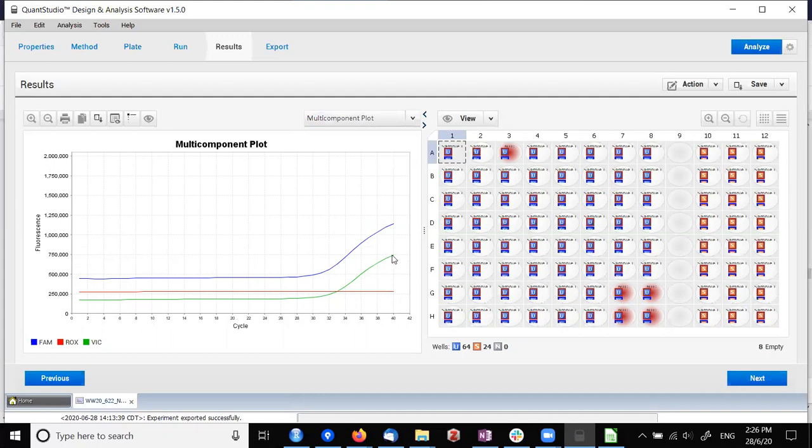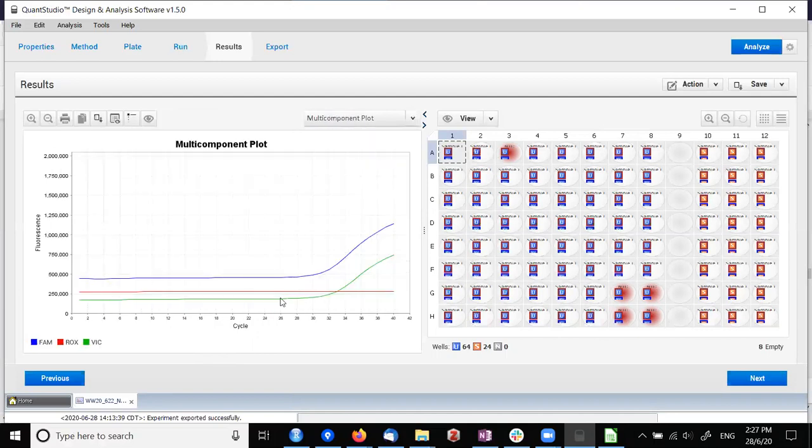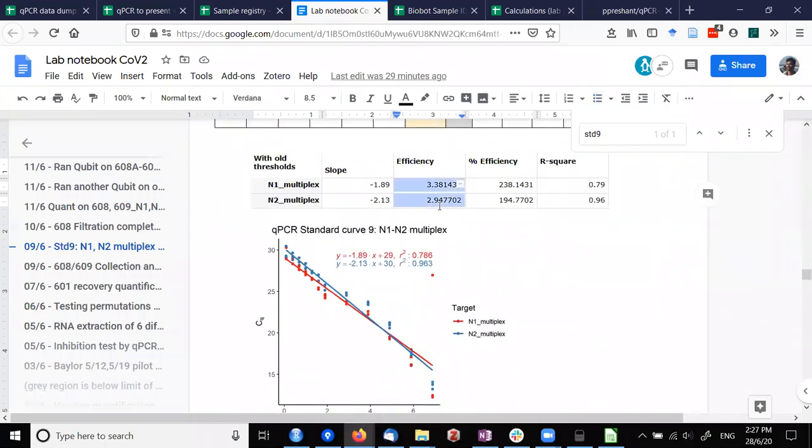Okay. So if you take the raw data, you can fit a sigmoidal equation to this, and if you extrapolate this curve right till the x-axis is 0, you'll get an initial fluorescence value. And when you fit this data, you'll get this linear region, because this is a log plot. This is not a log plot, this is a log plot, so this is the linear region. This is the same as the exponential growth region here in this tiny area. So if you fit your curve to that, it will also give you another approximation of this efficiency that we are calculating. So you can do that for individual samples.